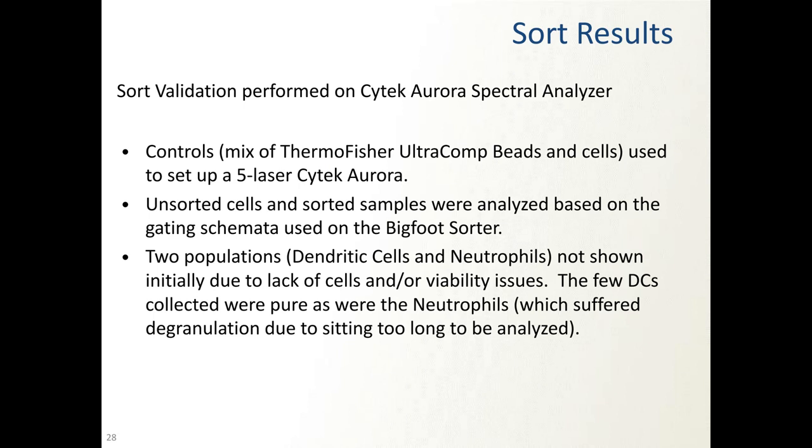The other issue is that when we're doing these things, I can't shut down my lab to the other researchers to gain access to all the instrumentation. I was basically waiting in line behind other researchers who were using the Aurora to try to jump on so I could run our samples. Because of that, it didn't look as perfect as I wanted it to, but as I'm going to show you, it worked.